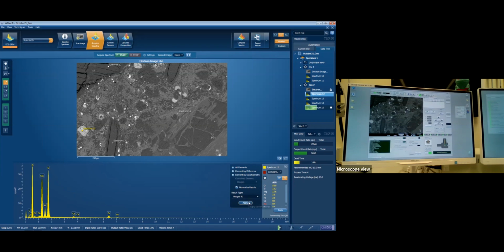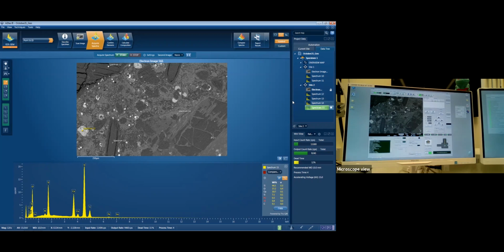So pyroxene is a really common mineral. It makes up basically everything, actually. You can find it in all sorts of lavas. It's a huge part of the Earth's mantle. It's one of the first minerals that forms. And we'll plot back on this, we'll see where we're going. So it's a hugely important one.